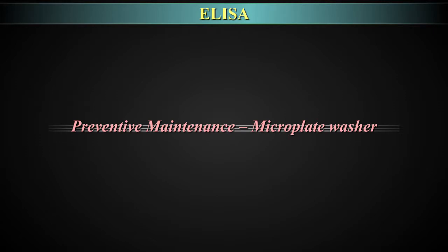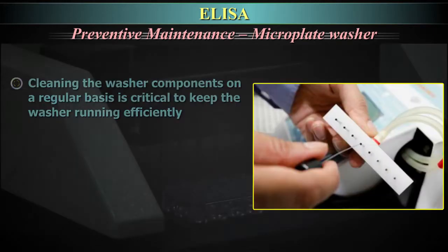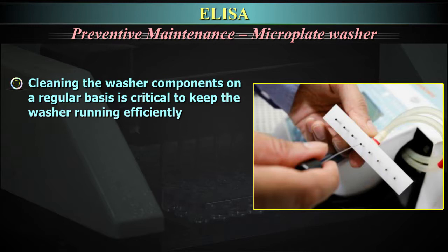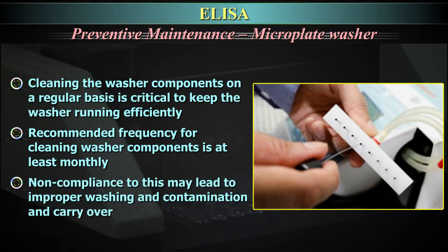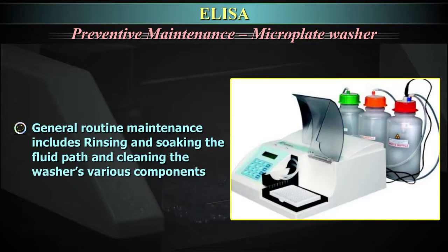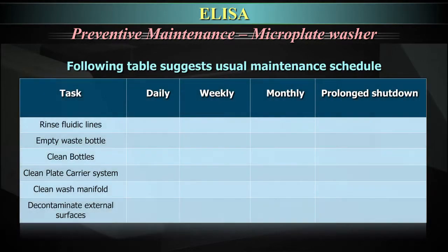Preventive maintenance of the microplate washer. Cleaning the washer components on a regular basis is critical to keep the washer running efficiently. The recommended frequency for cleaning washer components is at least monthly. Non-compliance may lead to improper washing, contamination and carryover. General routine maintenance includes rinsing and soaking the fluid path and cleaning the washer's various components.